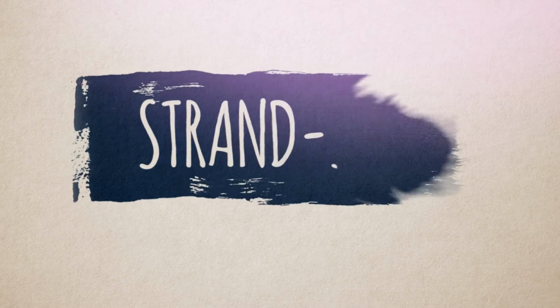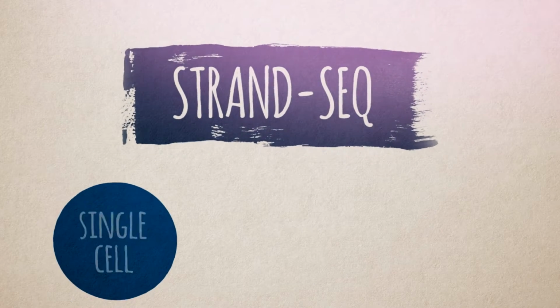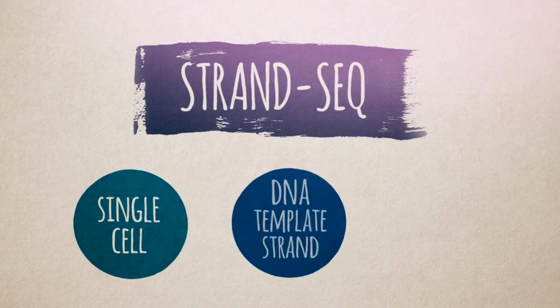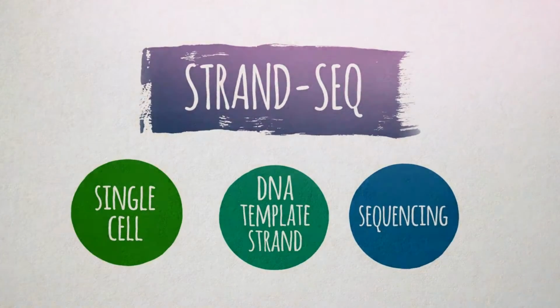Strand-Seq is a method for single-cell DNA template strand sequencing. It was originally developed for tracking DNA strand segregation during cell division, but has many other applications as well.